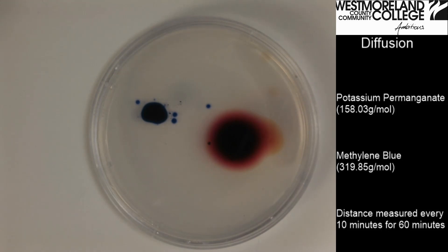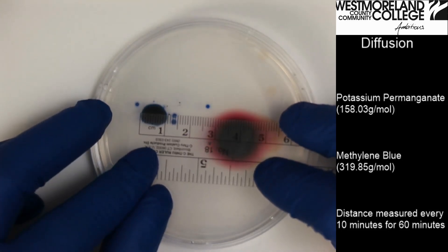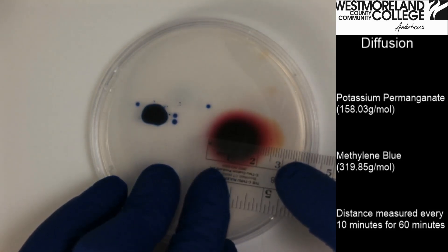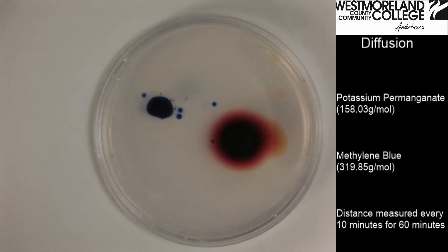That has been ten minutes for a total of 60 minutes, and I'll take my last measurement. The methylene blue appears to be 11 millimeters, and the potassium permanganate appears to be about 25 millimeters. That has been 60 minutes worth of measurements, so you're now able to calculate your rate of diffusion.